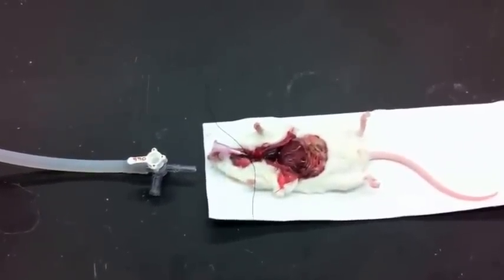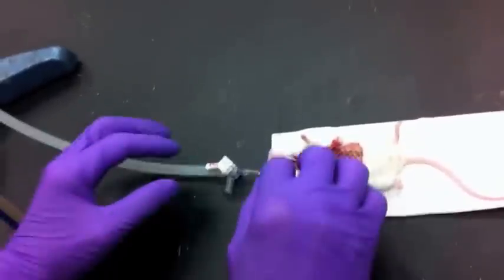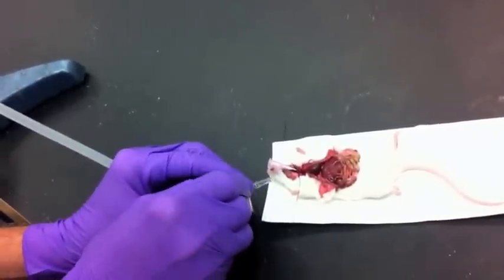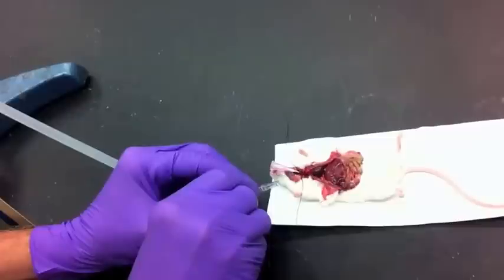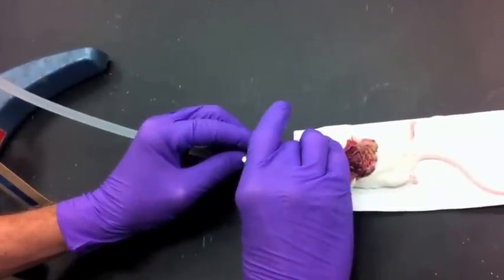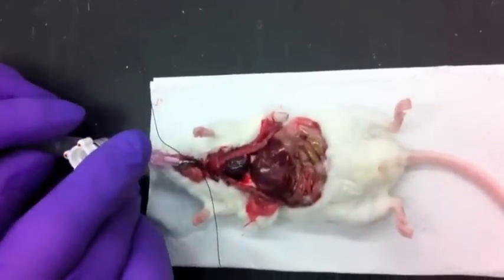We're going to connect the stopcock and let the fixative flow out of the stopcock to make sure there are no bubbles. Open the stopcock and let it flow out under the pressure head of 25 centimeters. Then it's going to be connected to the mouse, opened up, and you should be able to see the lung inflate.